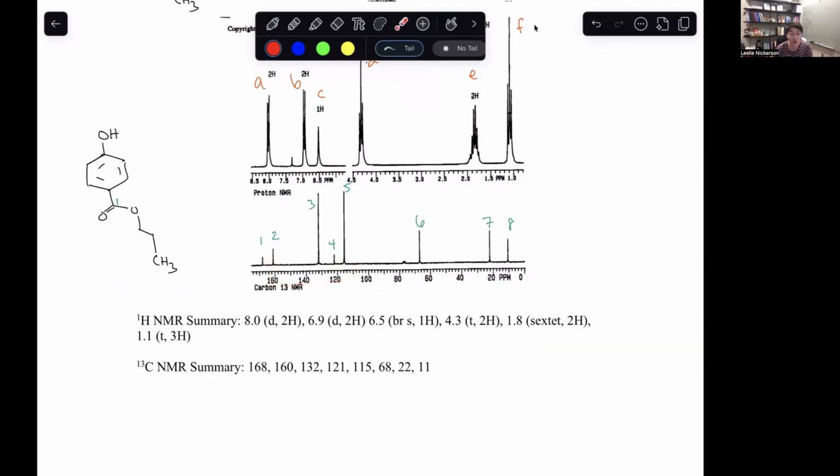Okay, one little trick to be thinking about here in terms of carbon NMR, you can't technically do integration, but you can do kind of like a fake integration where carbons that are about twice as tall are probably 2 carbons in that environment. Okay, if I have a really, really short carbon peak, we probably don't have any hydrogens on it.